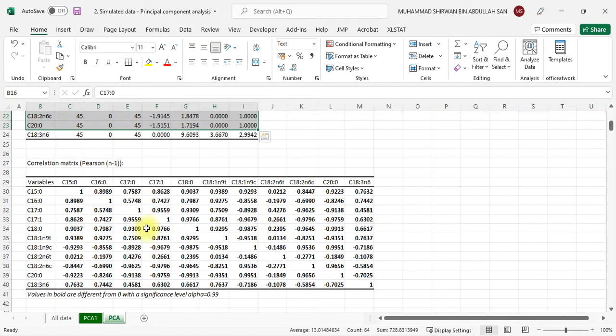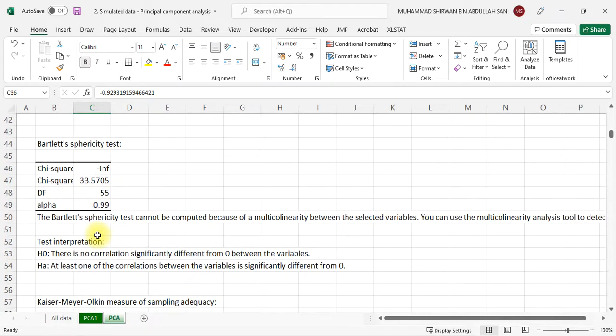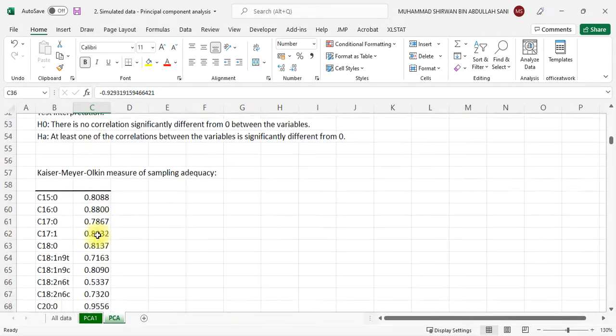All right. This one is similar to the DA, we have the correlation matrix. Same as before: 0.7 is strong, then moderate, weak, and so on and so forth. A negative value indicates they are inversely proportional. This one is not important.